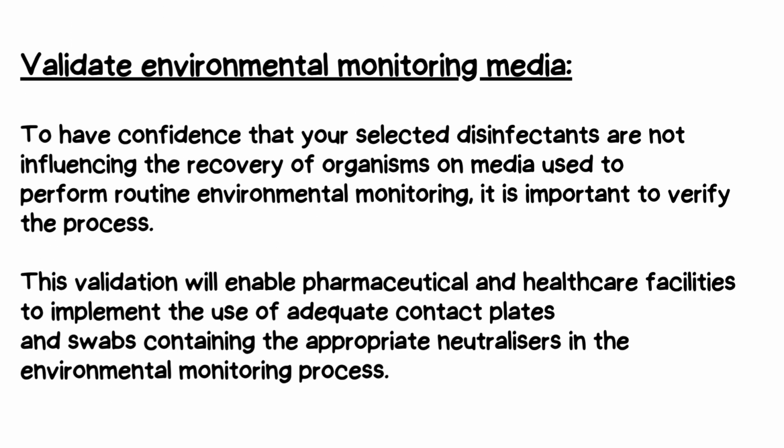Validate environmental monitoring media. To have confidence that your selected disinfectants are not influencing the recovery of organisms on media used to perform routine environmental monitoring, it is important to verify the process. This validation will enable pharmaceutical and healthcare facilities to implement the use of adequate contact plates and swabs containing the appropriate neutralizers in the environmental monitoring process.